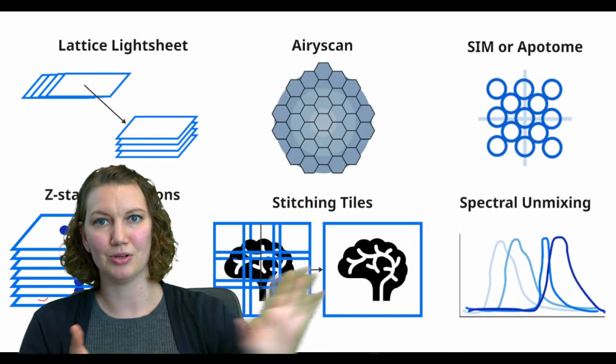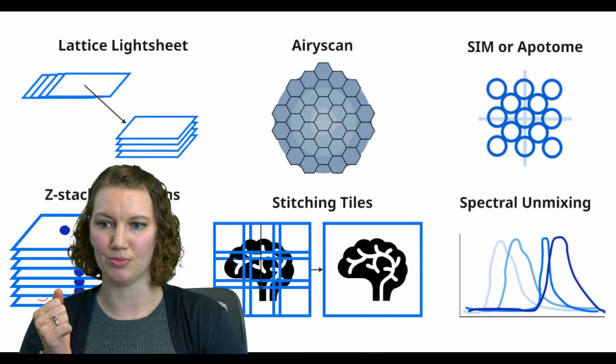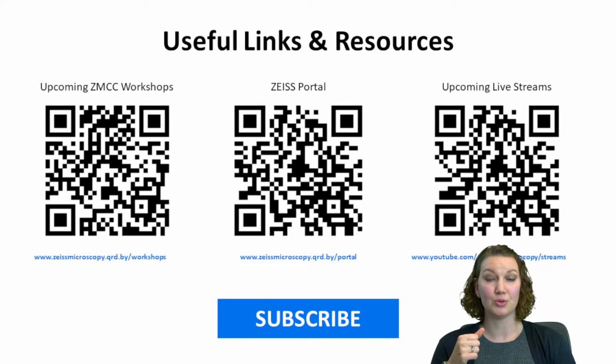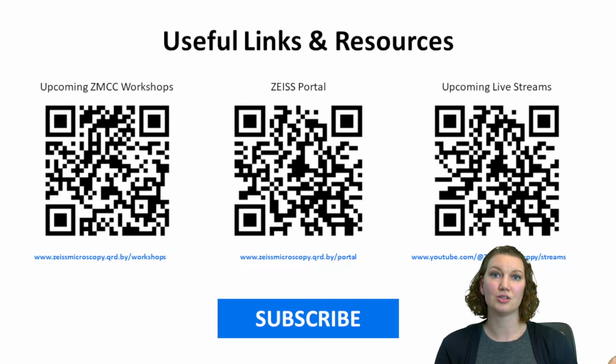You just tell the computer to do everything for you, and then it's ready to port into whatever analysis software you might need. And so with that, I'm keeping an eye on the chat. So if anybody does have questions, please feel free to ask there. But again, we're part of your digital engagement team here at the Zeiss Microscopy Customer Center. Just because we can't physically be right beside you, we are here as your resource. So always reach out to us.